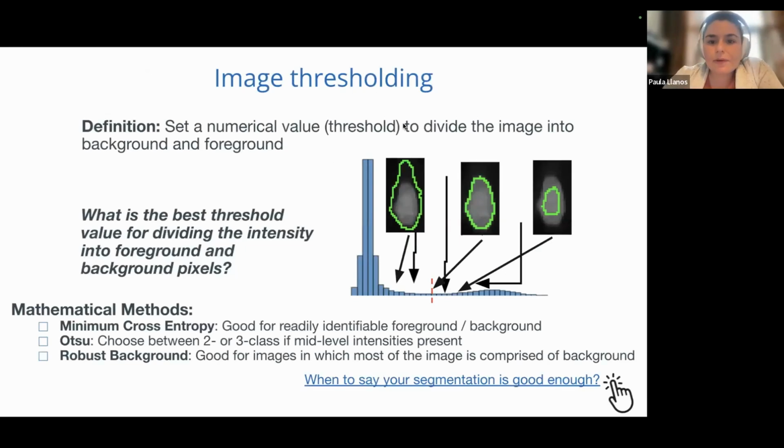In these thresholding modules, it's important to know what that means. When we apply thresholding, we just differentiate what is the foreground and what is the background in the image. To do that, you can set the threshold manually. For example, in the image we have this histogram. If you set the threshold here, almost all the pixels will be part of the background. For example, these pixels have a very low intensity value, which means they are more in the background. So you can set the threshold wherever you want. This intensity, for example, is allowed for the pixels that correspond to actual nuclei signal.